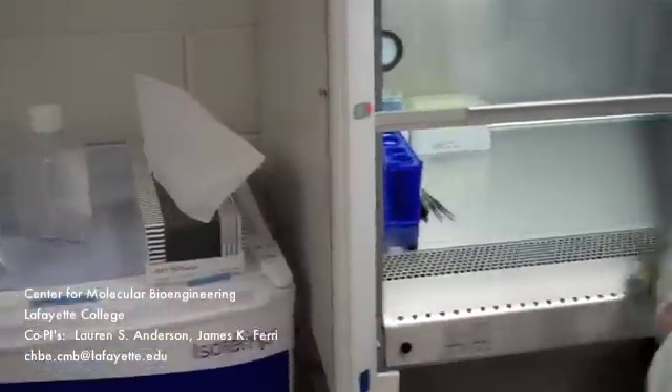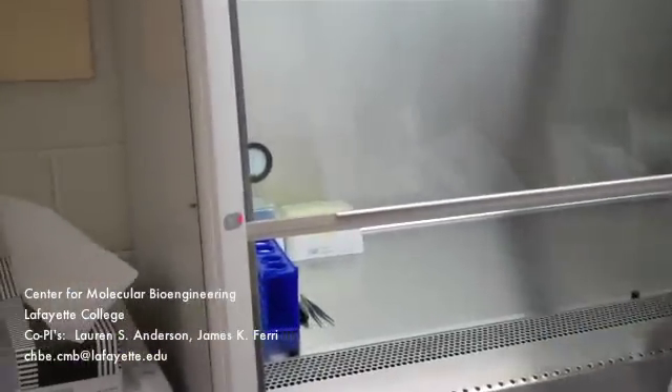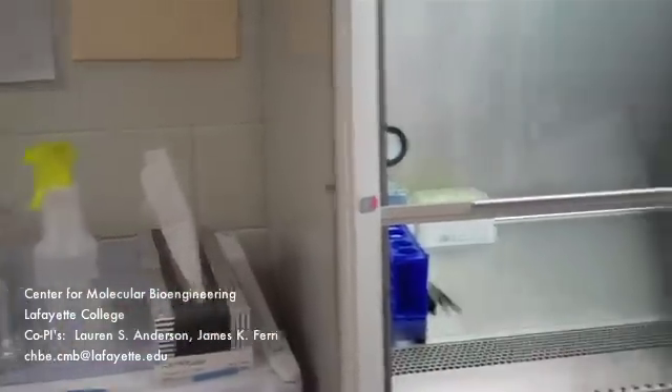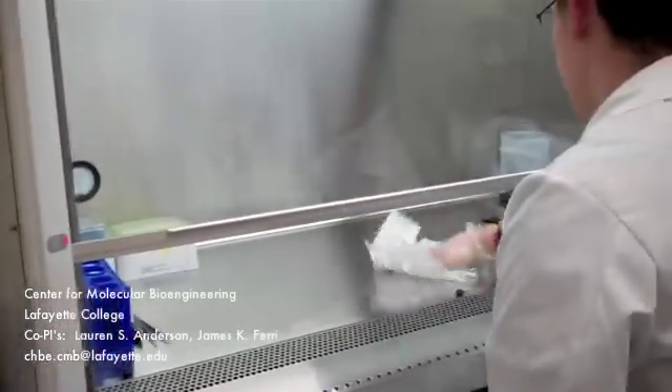Next, continue to spray isopropyl alcohol on the inside of the biosafety cabinet workspace and the inside window. This is a standard procedure for any work in the biosafety cabinet and it is necessary to begin all procedures in this way.